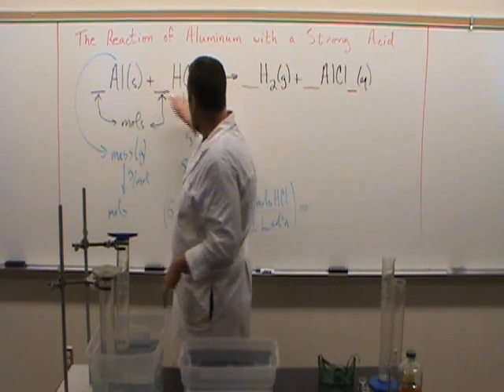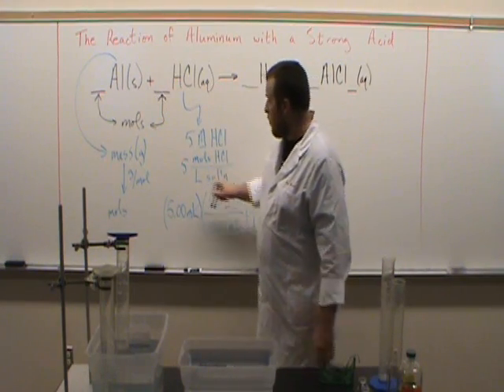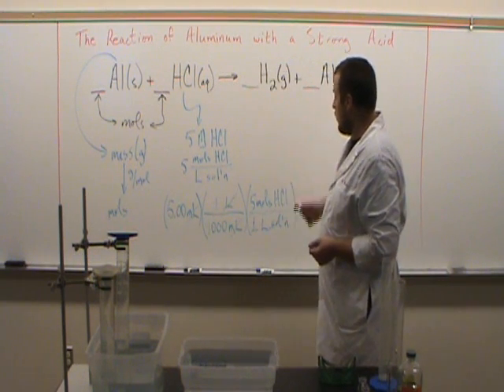So that's really going to be the big point of the experiment. We're going to react different amounts of these, and by looking at the mole ratio and our observation, we're going to be able to determine what's going on in the reaction.